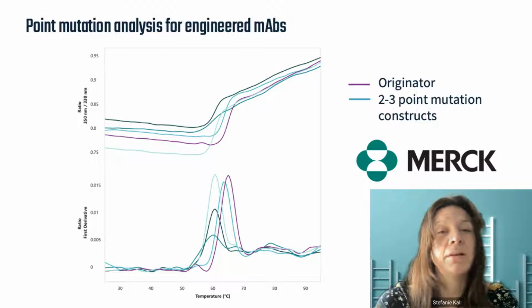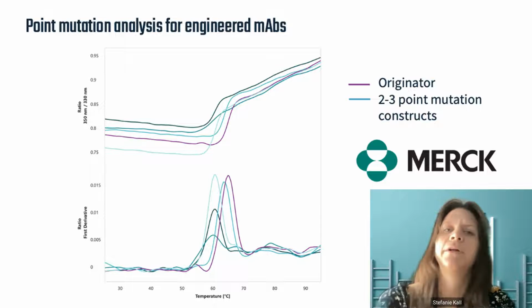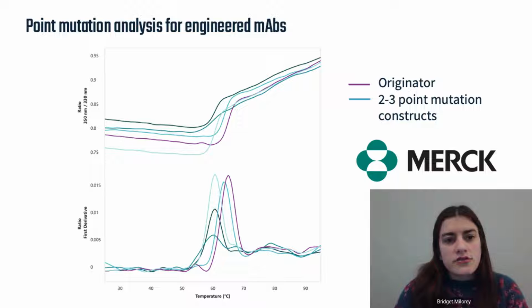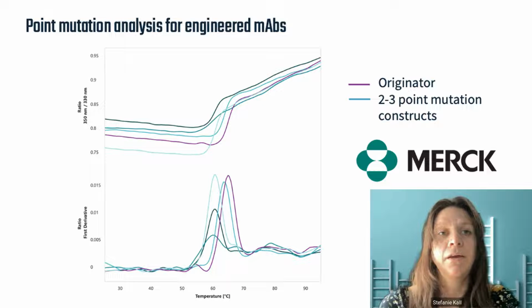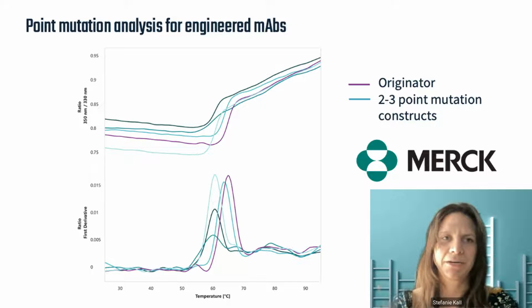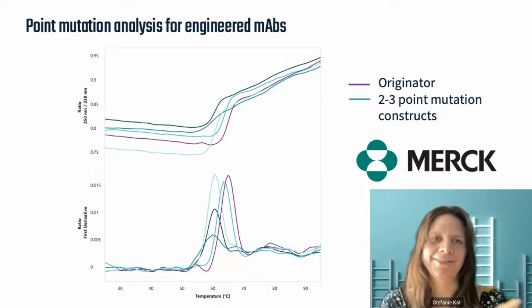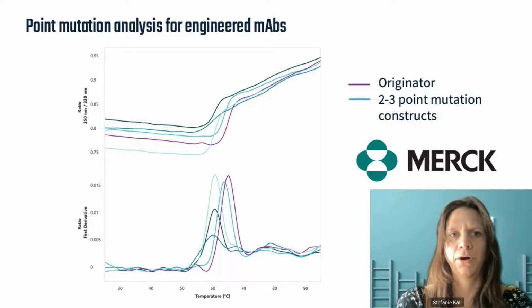Awesome. And then is there anything else to think about if anyone watching wanted to set up their own experiment like this? Yeah, so for an experiment like this, where you are comparing to a reference, it is very critical to run all of your samples at the same concentration and all in the same buffer conditions. Yeah, those careful controls are really critical just to make sure that those differences in constructs are related only to the sequence change and not any other variable like concentration or buffer.